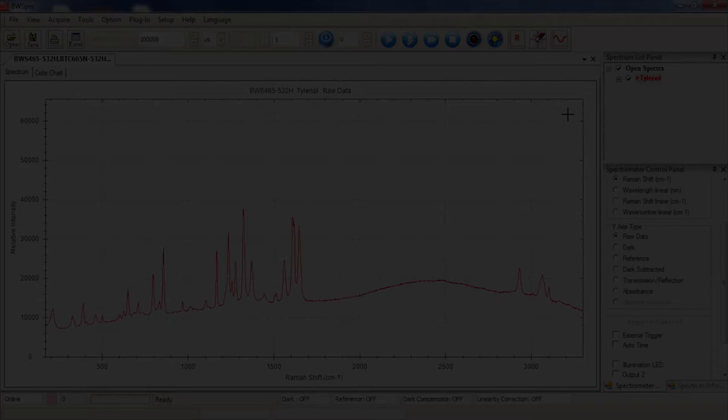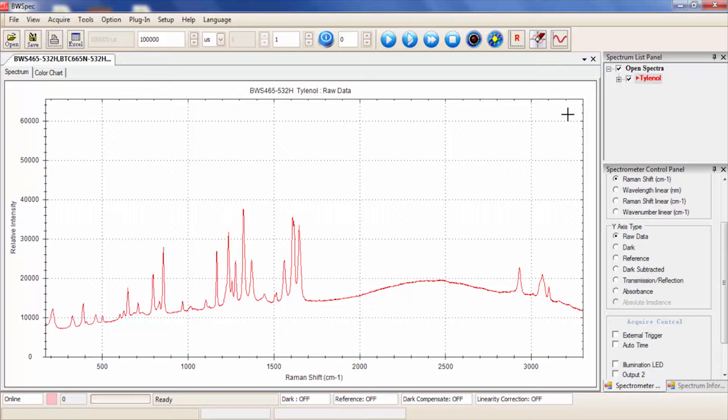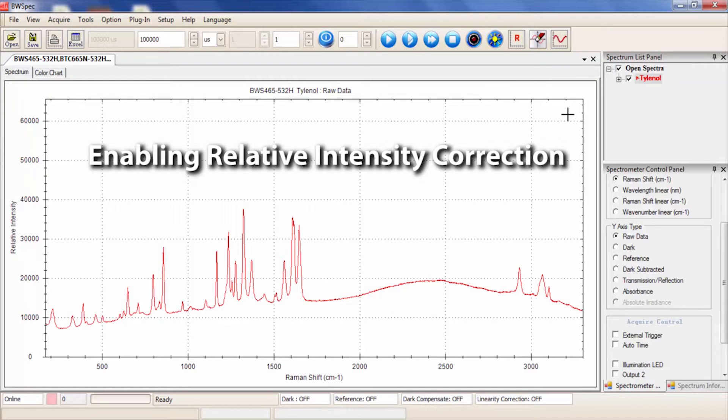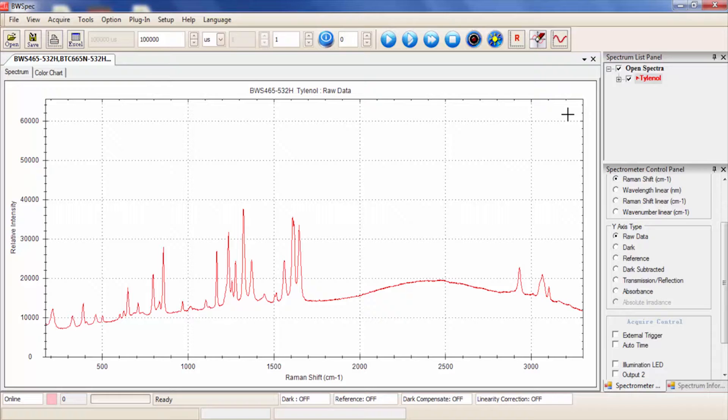Users may also be interested in Relative Intensity Correction, which is a Spectral Response Shape Correction. This eliminates spectral response differences between instruments. Enable Relative Intensity Correction when using the instrument for quantitative measurement or chemometrics, for eliminating instrument-to-instrument variabilities when comparing data, and for comparing different laser excitation wavelengths.